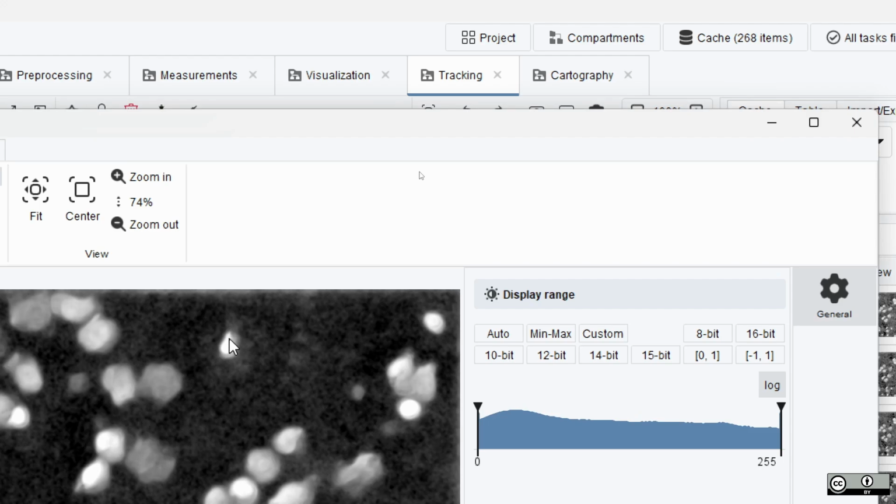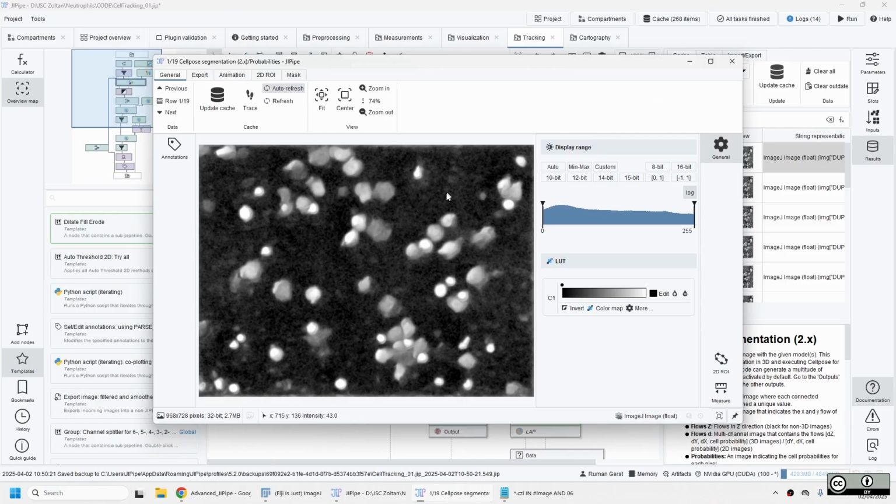then this shows you a map as an image. What this one does is it tells you that the brighter pixels have a higher probability to belong to a neutrophil. So for example, this area here is just background. These bright ones, the deep learning model is sure that it's a neutrophil. These ones, it's like, yeah, it's probably one.